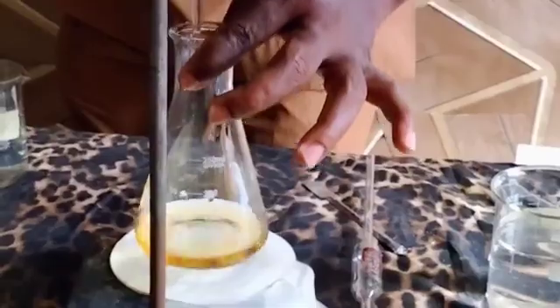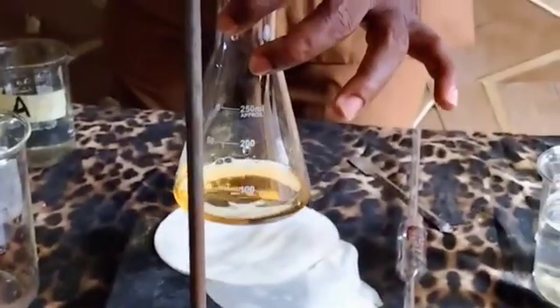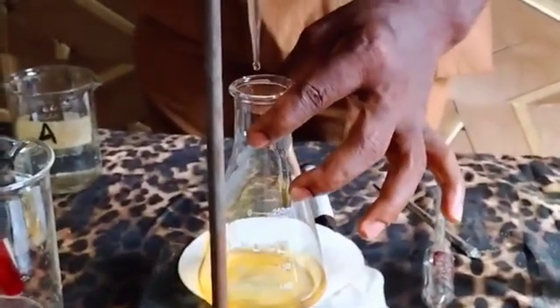So let me increase it a little. You swirl your flask. Continue titrating. So let me allow it to be dropping little by little.